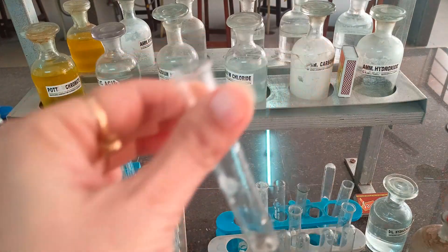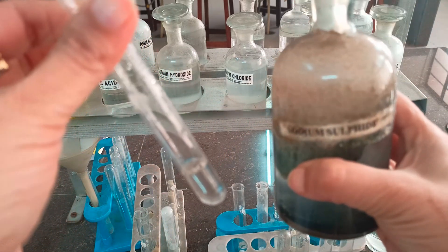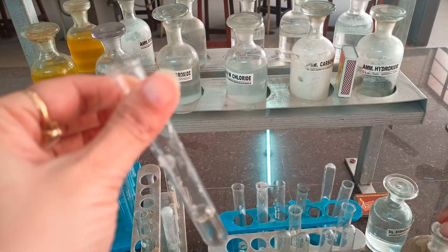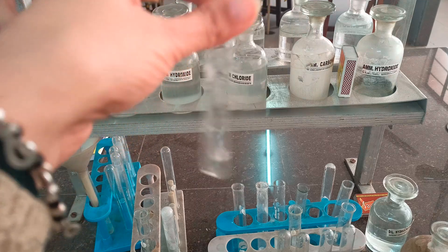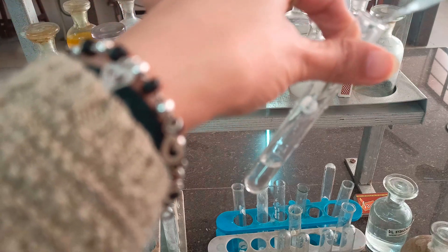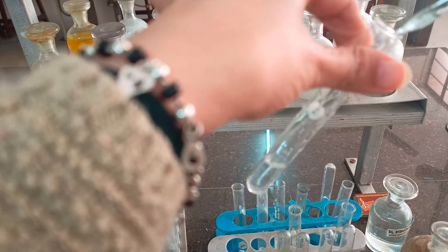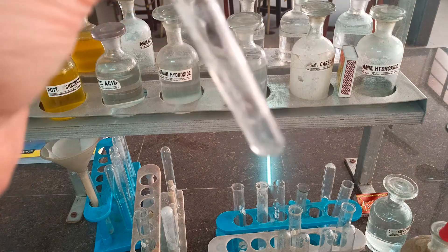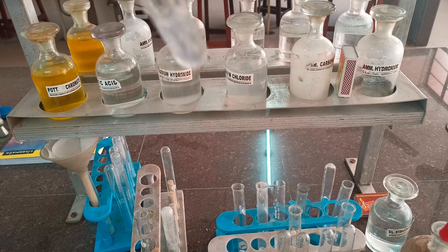For Group 2, we are using sodium sulfide instead of passing H₂S gas, as is preferred in the lab. The solution contains HCl and I am adding sodium sulfide drop by drop with a dropper. No precipitates are observed, so Group 2 is absent and we discard this solution.